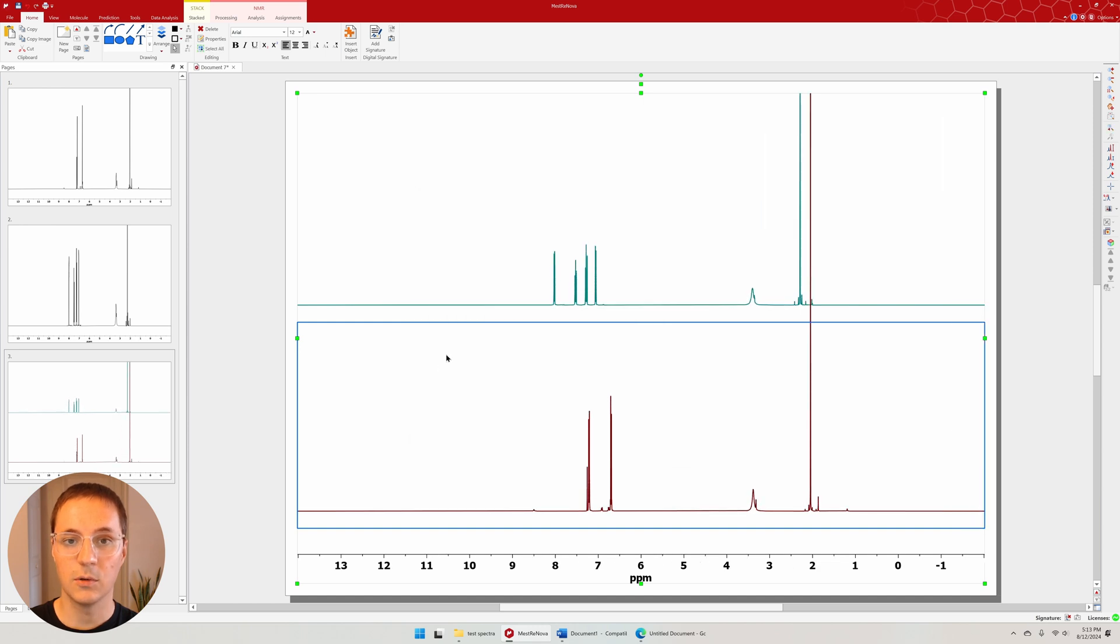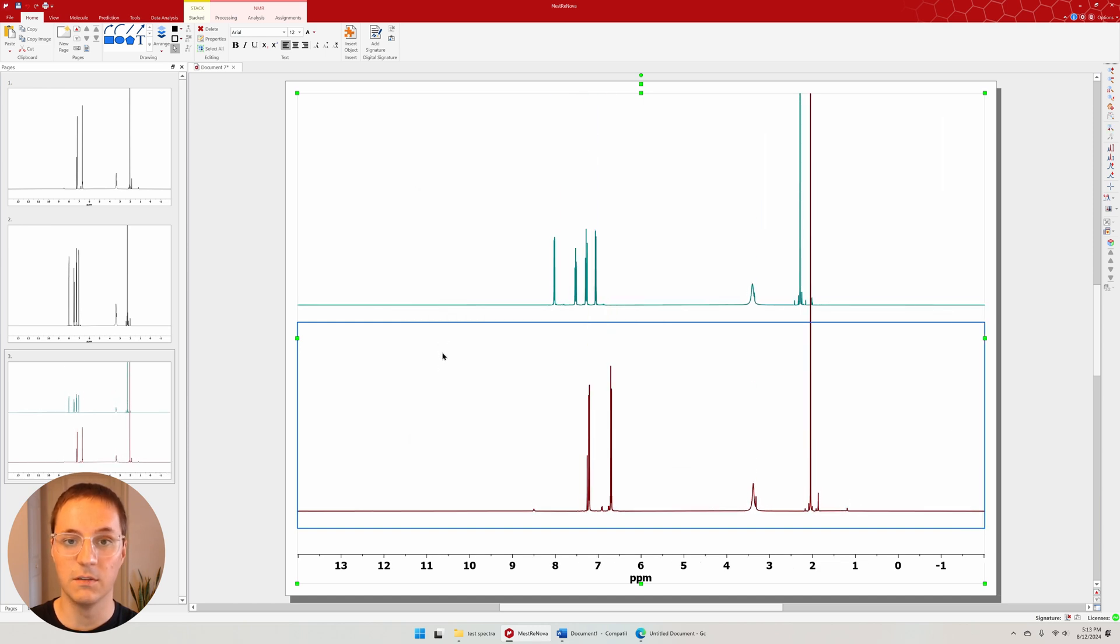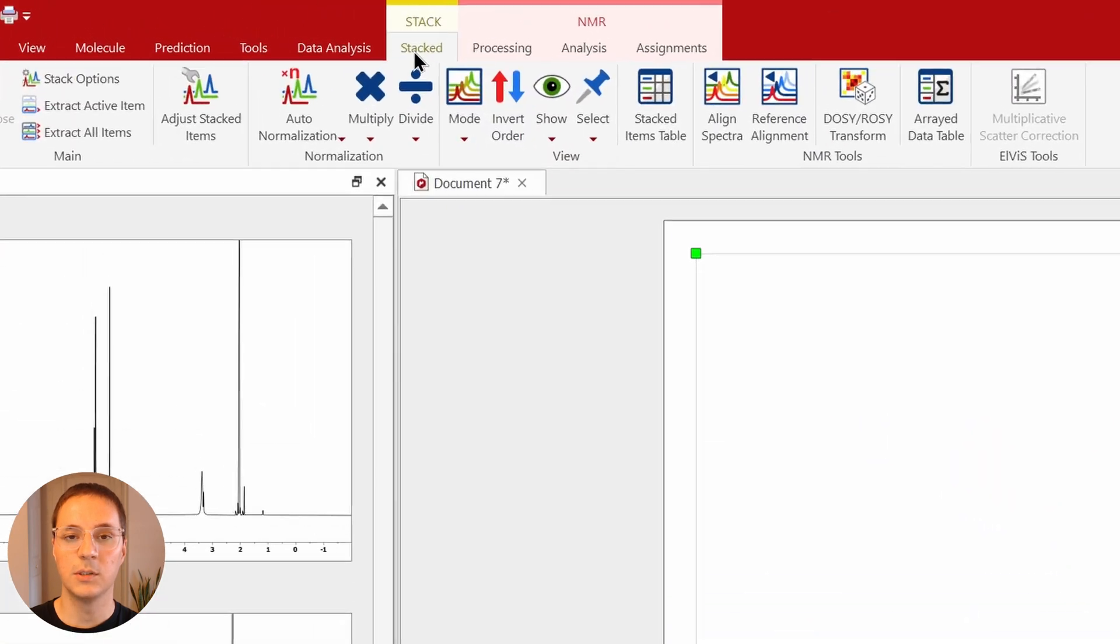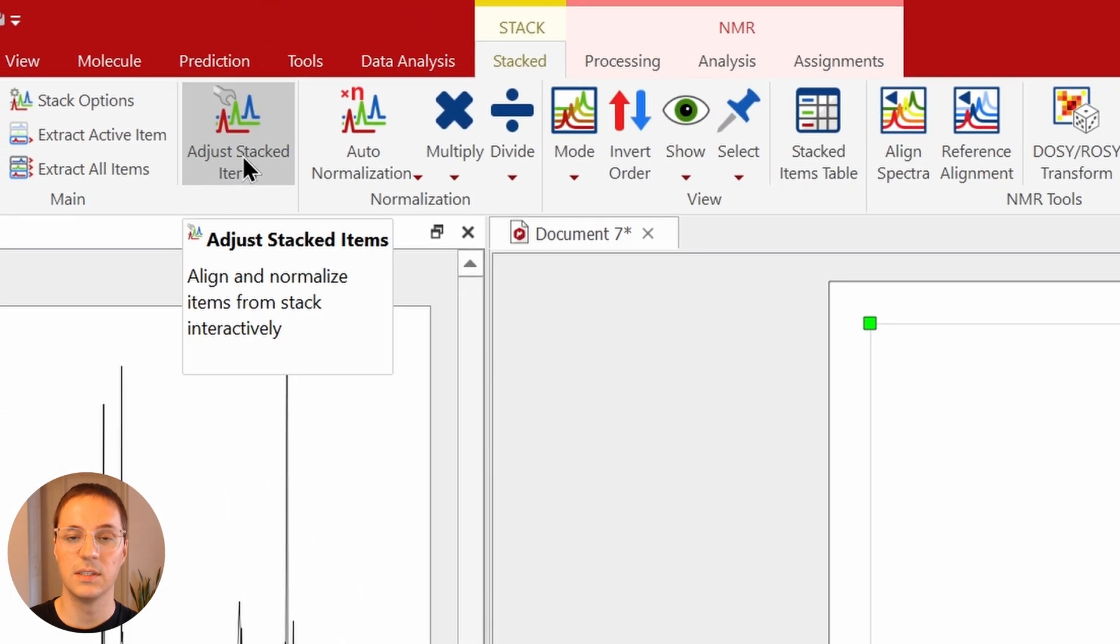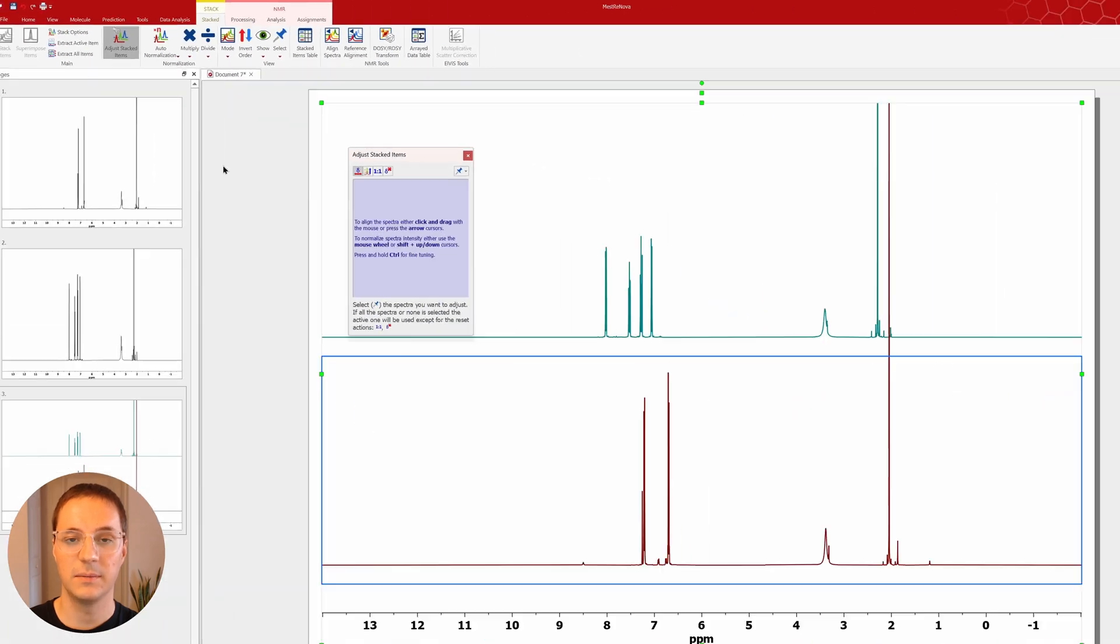Using the scroll wheel here, adjust the intensity of both spectra. If you only want to adjust one spectrum, use the adjust stacked items function under the stacked tab.